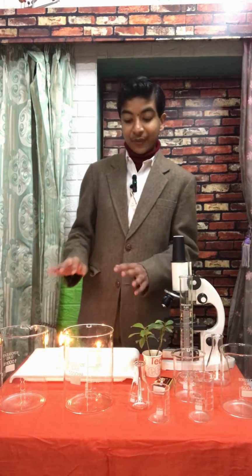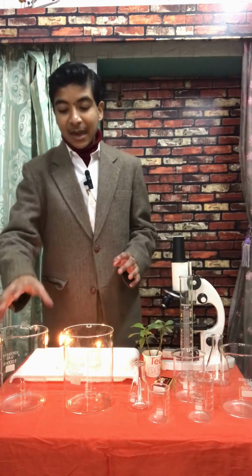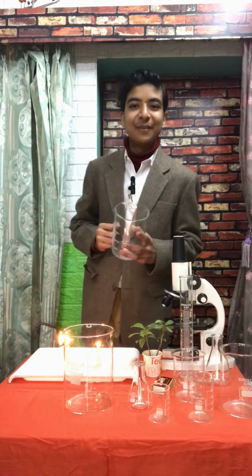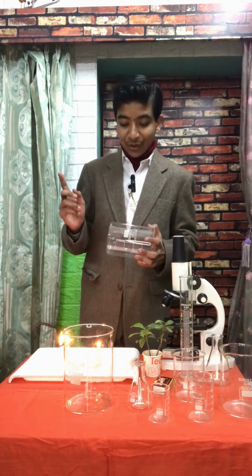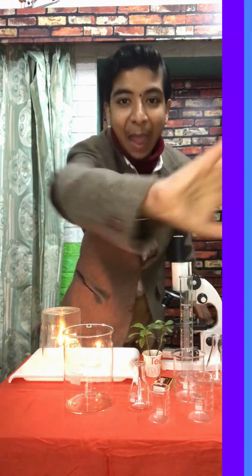Okay, so we are ready with our two candles, and now I will pick one of the beakers, and on the count of three, you also count with me. On a count of three, I will put this beaker on the candle. Okay, so let's put it. Three, two, and one. Fine. Let's just see what happens.